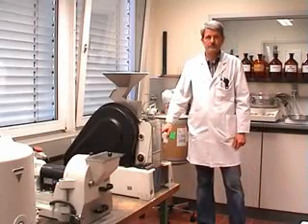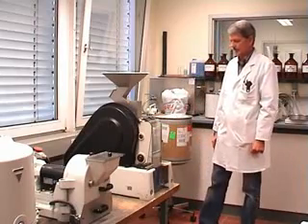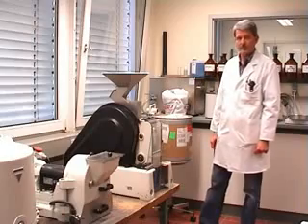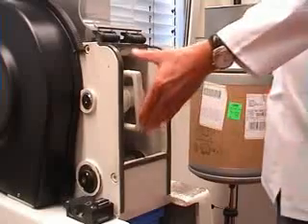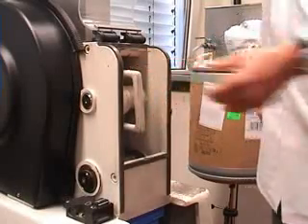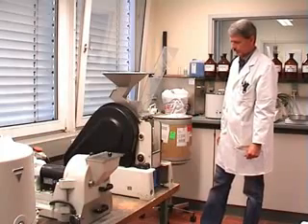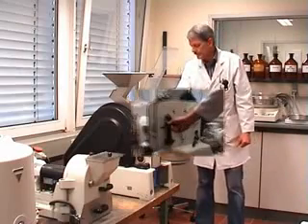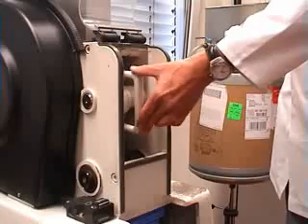We can set the gap of the jaws manually outside of the machine. My colleague will now show you the largest possible gap size, and then change manually to the smallest gap.